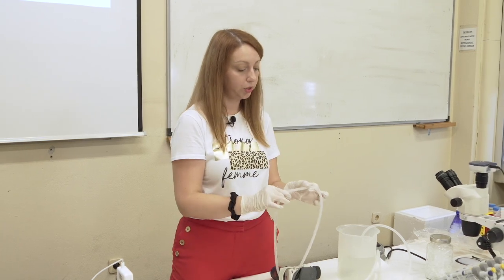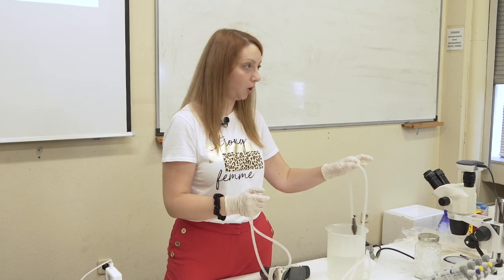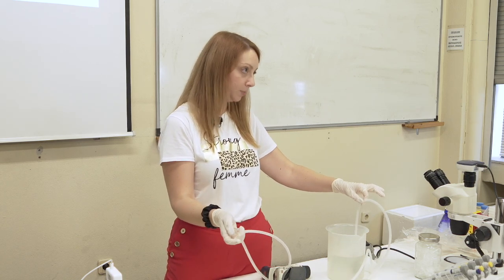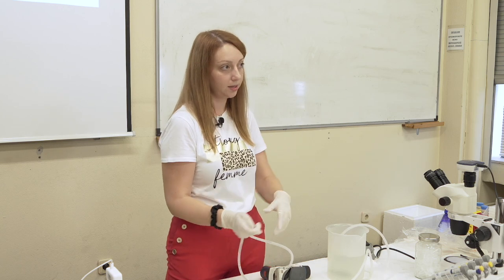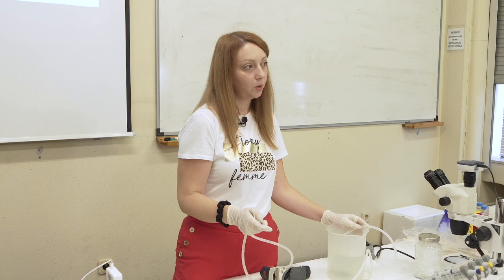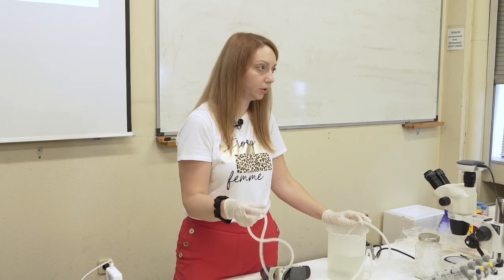Now, I was just wondering, it means that when you clean the filter, you have a lot of different tubes? Yeah. It's important to sterilize all the hoses you use, and it's important to have a different hose for each sampling site, so as to avoid any contamination between the sampling sites. With bleach solution, and rinse it with distilled water.